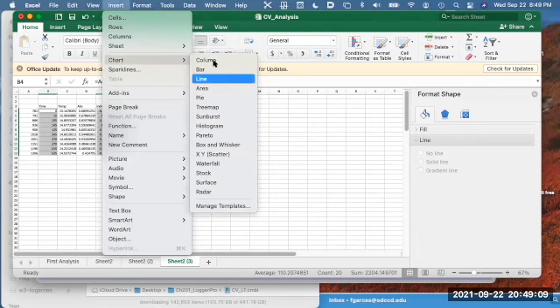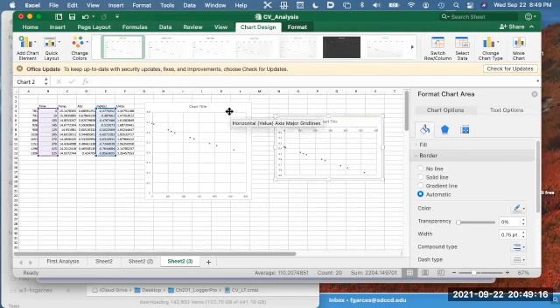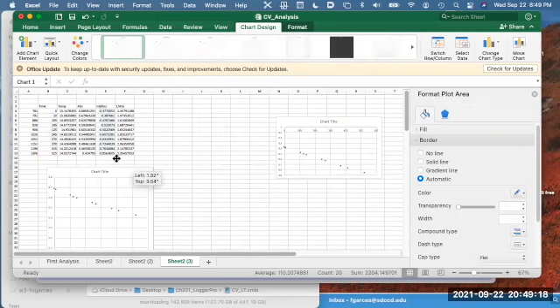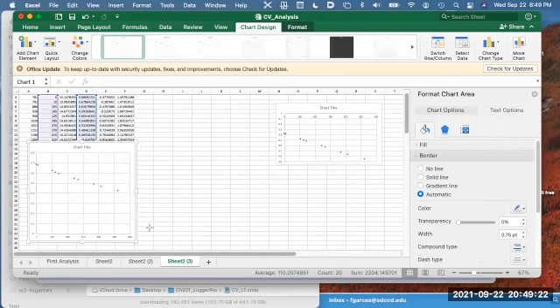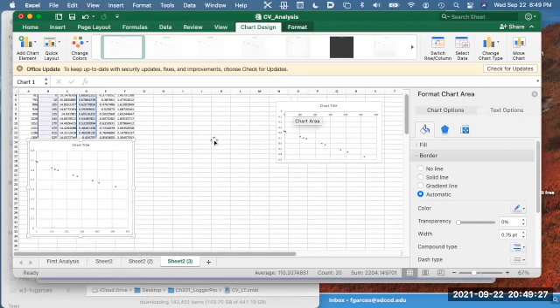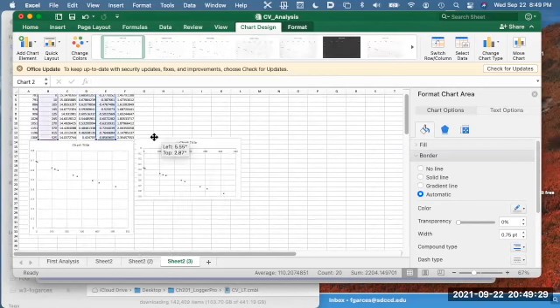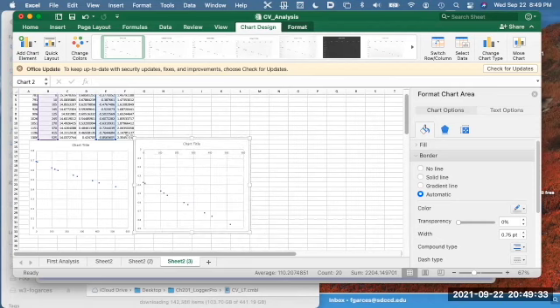What I want to show here is that selecting a few data points versus selecting the whole data points that you generated will pretty much be similar in terms of the correlation factor, the slope and the intercept. So again, I'm just generating this graph and I'm putting it down here so that you can see all three.